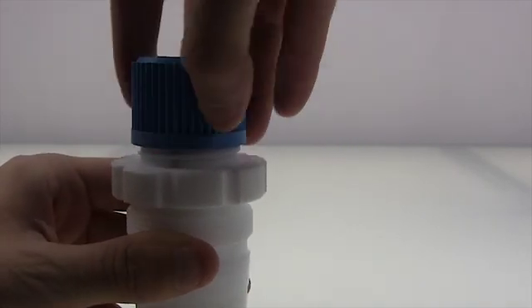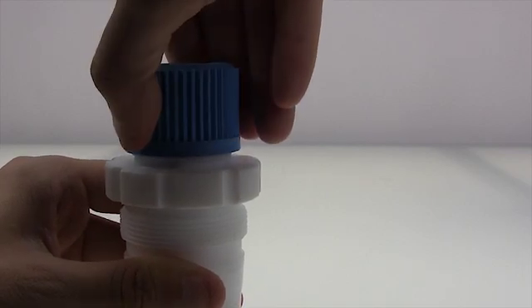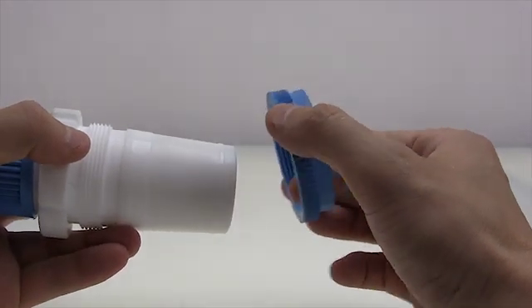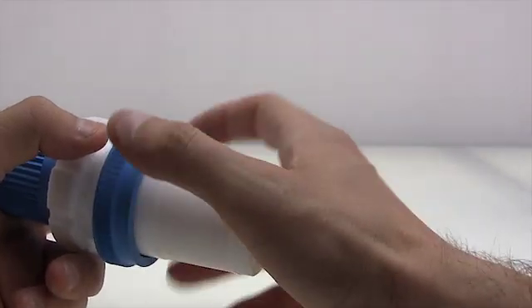Once you feel some resistance, it's just a quarter turn more. Finally, take your loosening nut wide side first and just screw it on.